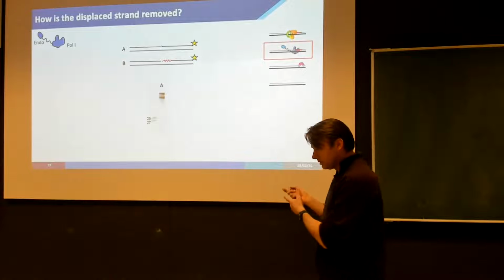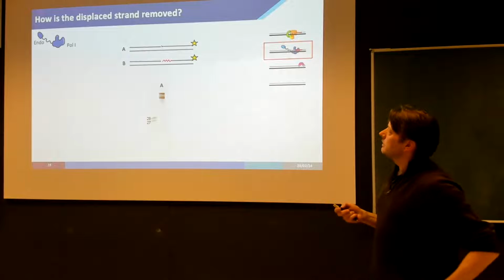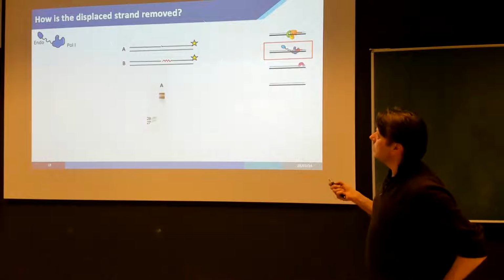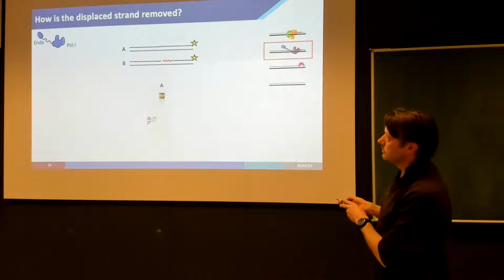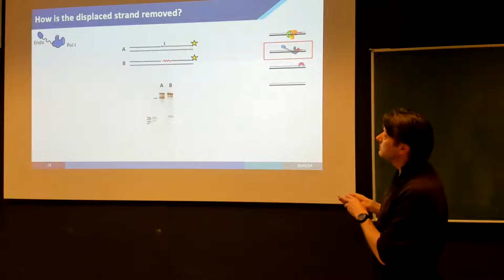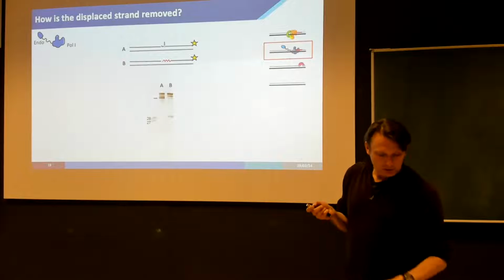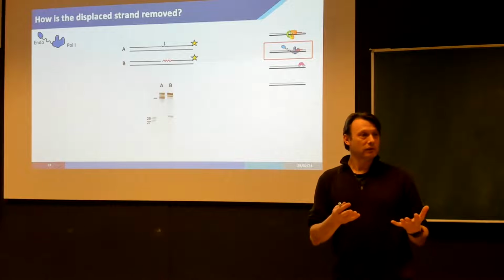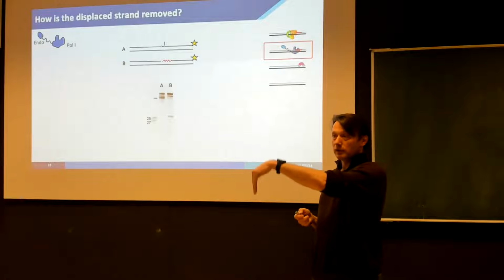So we then wondered, well, this was all done with DNA, because we had previously seen there's not a big difference between DNA and RNA. But in this case, we wanted to know if there might be a difference anyway. So we did the same experiment with a DNA substrate and one where we incorporated a short RNA primer. On the DNA substrate, we had a single nucleotide flap, and we see the typical cutting as we saw before. But when we now take an RNA primer, we find something else. There's an additional cut, which is happening exactly at the RNA-DNA junction. So somehow, this endonuclease is not only a flap endonuclease, it's also a unique RNA-DNA junction endonuclease. It can mark the end of the RNA primer.